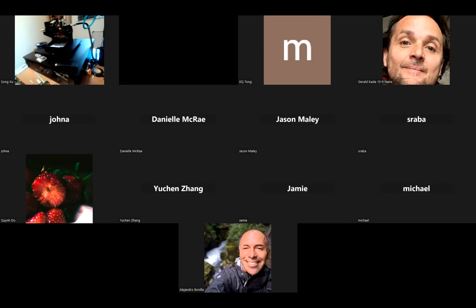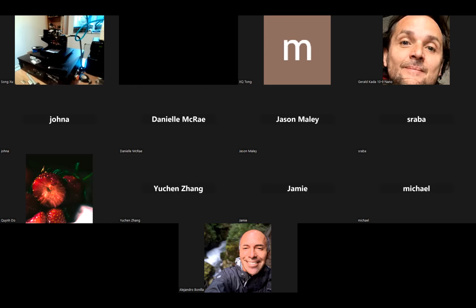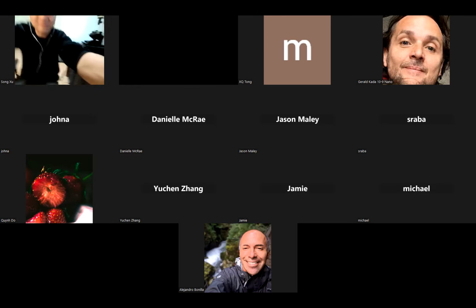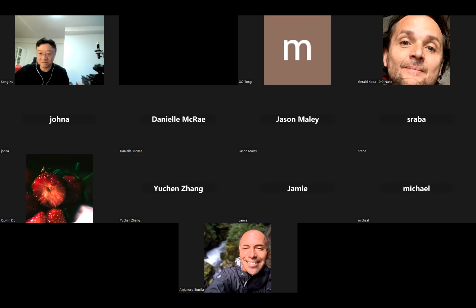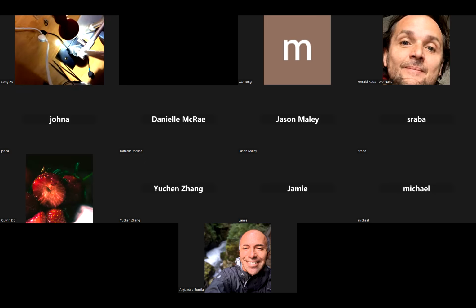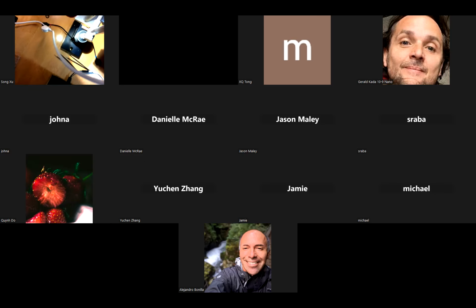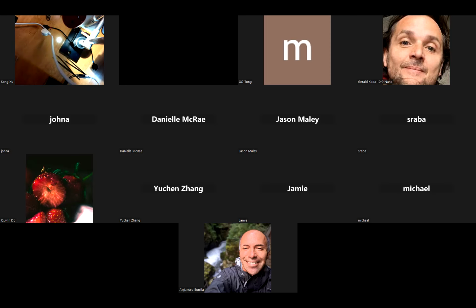Oh, by the way, before I do that, I'll show you the proper way to install your cantilever. And change to a different camera. I just installed this multiple camera system, so I can show you different views of different things. Here it is. Okay, so this is a camera that shows the cantilever, and I have a light here. Now, it's a scanner on the surface, and I have an optical microscope pointed very close to it. Let me switch to a different view. You can see very, very close to it. Here we go.